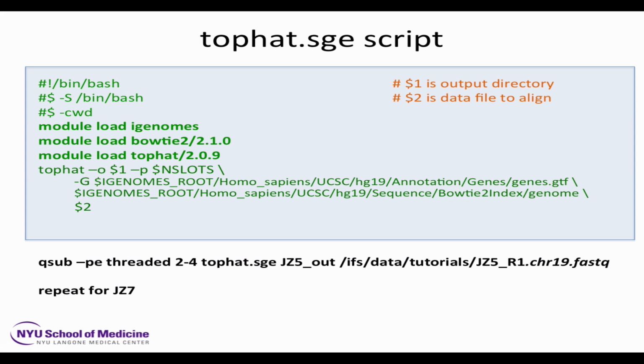There's a bit of a downside to that, which could be an upside, which is that some samples may have different isoforms than others. And so that will bias to some extent the overall per gene expression values, but you could dig into those isoform-specific samples and have some truly interesting discovery that a particular treatment invokes a particular isoform. So not limiting to just the known isoforms might be your best method.